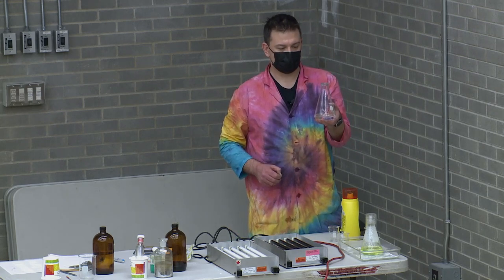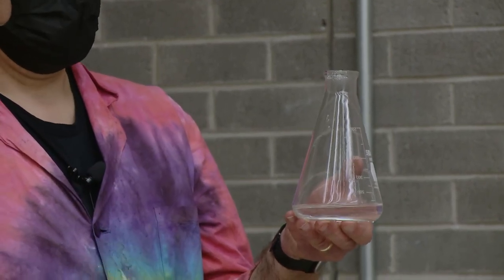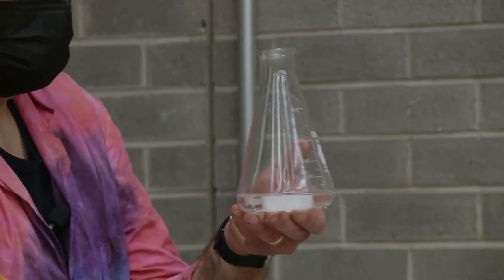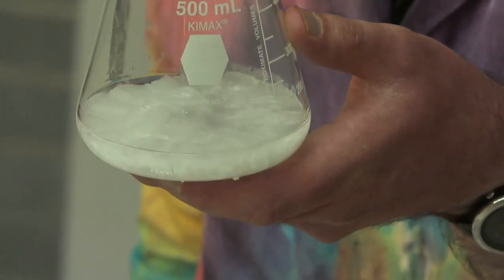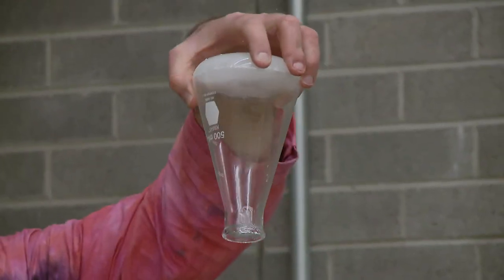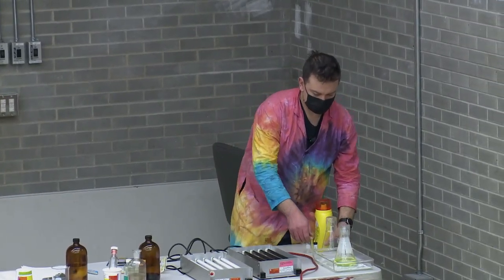Sodium acetate in water exhibits a very interesting property known as supersaturation. If I add just a little bit more sodium acetate — I heated it up with a little water so there's more dissolved than really should be — you can see it all comes crashing out in a hurry. This is also an exothermic process, so it's nice and warm on my hands.